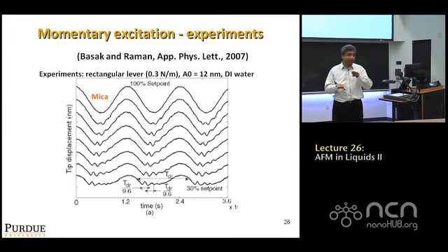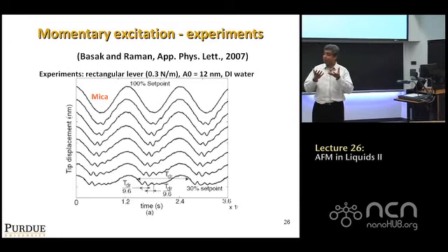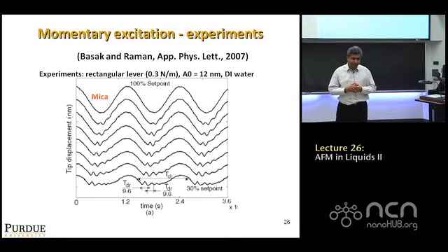I can look at total energy loss. During impact, it's lost energy. I can simply go, plonk it. I'm going to find that when I do it on the carpet, the basketball doesn't bounce back as much, which means more energy is lost during a collision. I do it on a hard surface, on concrete, I find it's going to bounce more. As a result, that is one intuitive way, and that's connected to energy dissipation, and that's connected to phase contrast also, right?